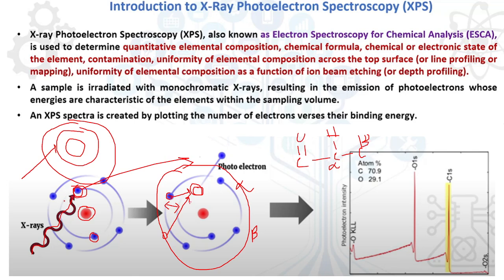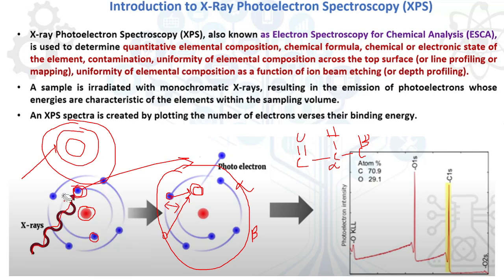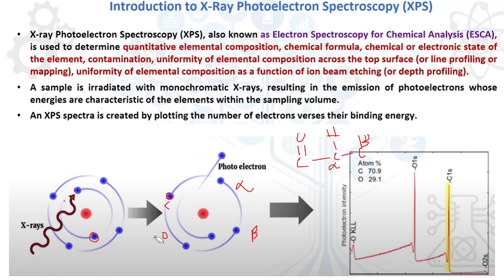Similarly, whether that electron transfer takes place from the next shell or next to next, based on that it is called K alpha or K beta. Is it clear what the difference between alpha and beta is? Otherwise, I will discuss again. The same concept, whether it is alpha carbon or beta carbon, similarly whether it is K alpha or K beta.